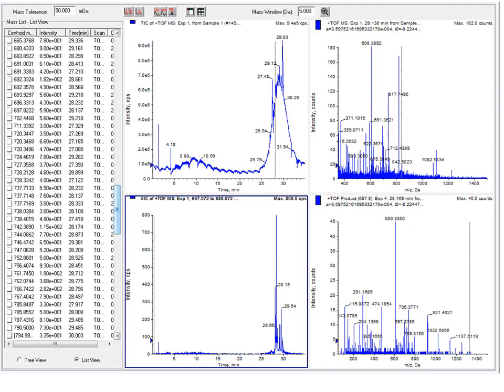So what data does the mass spectrometer actually produce? This image is taken from an AB-SciX quadrupole TOF machine, but data from other manufacturers looks essentially the same. Every half a second, the instrument scans a mass range, in this case 350 to 1500 Daltons. This is an MS scan and shows all of the intact ions that are being sprayed into the mass spectrometer at a particular time. The intensity of all of these ions is summed, and a point is plotted on the total ion chromatogram, or TIC, indicated by this line.